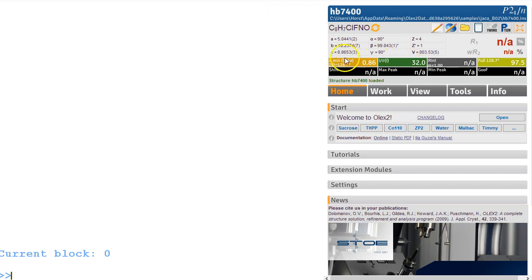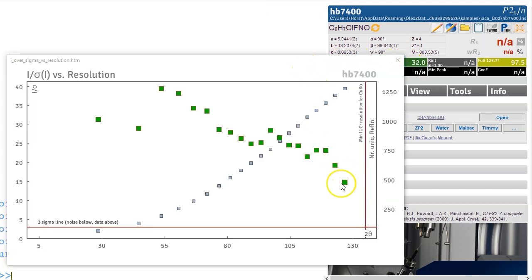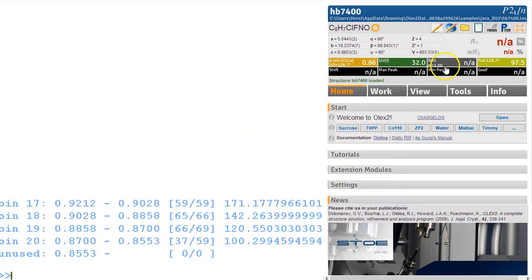Now we have I over sigma is quite strong and for some reason it stops just before it reaches the IUCr minimum resolution. It's a bit strange. Also it's merged data so this is why we don't have an R-int. It shouldn't really happen, there's no reason why there should ever be merged data anymore.